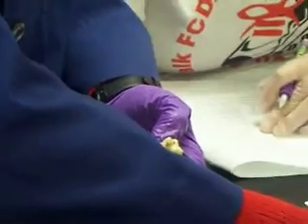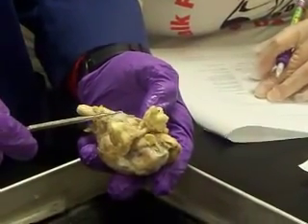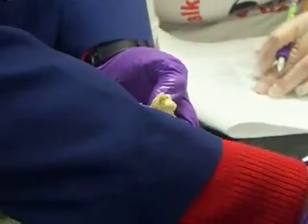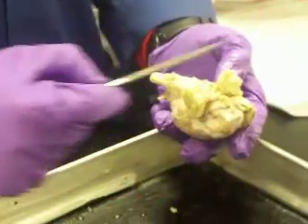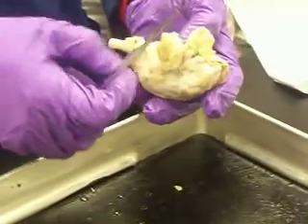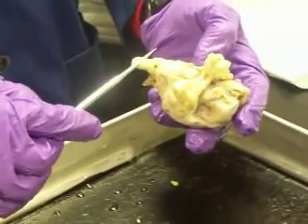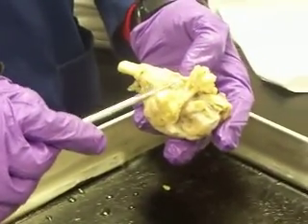So this first one is the medulla oblongata here. And then after that, you're going to have the pons here. Now that's pretty critical because superficial to those, you'll see these little tiny nerves, which we can't see yet because of the meninges. So we're going to have to be very careful in moving the meninges away so we don't cut those off. So spinal cord, medulla oblongata, pons, and then there's this other thing here.